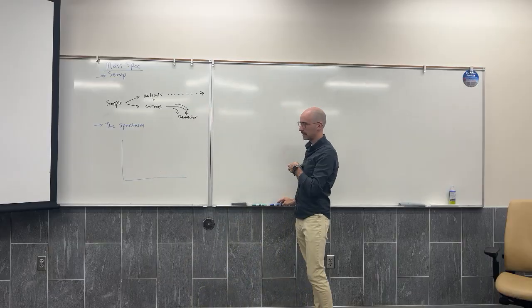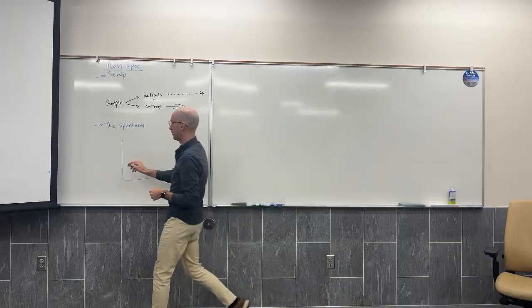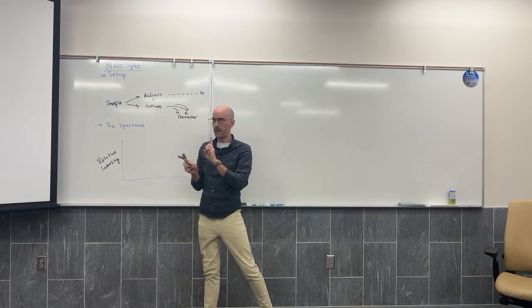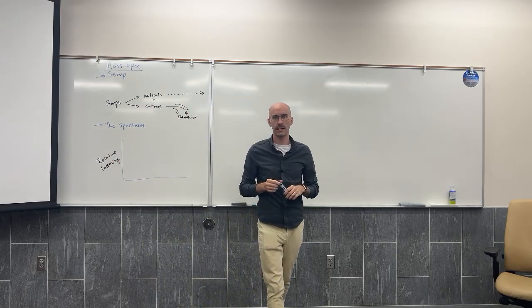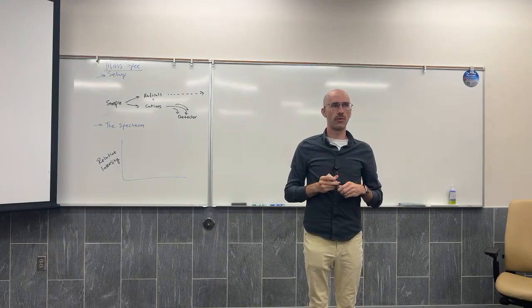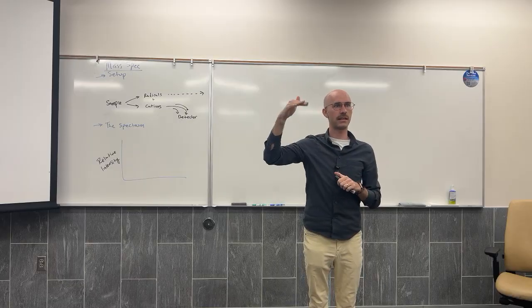The y-axis of our spectrum is relative intensity. Which means that the numbers are a bit meaningless, or another way to say that is the numbers are normalized. So we don't look at it and say, what is that peak going to?